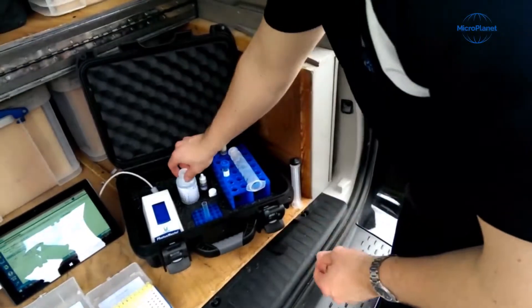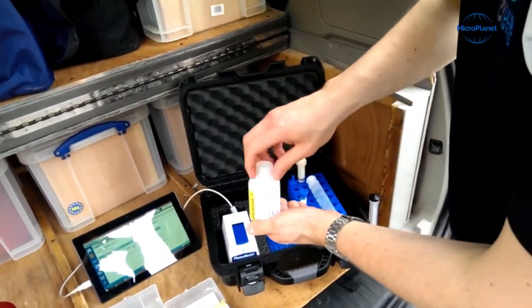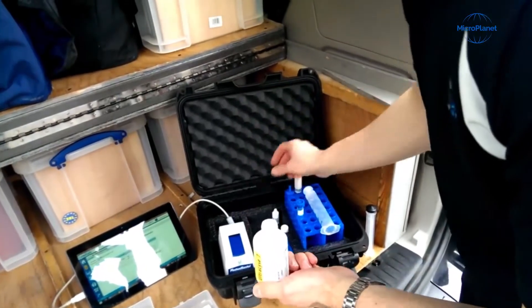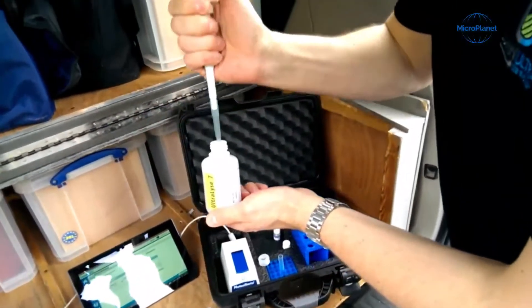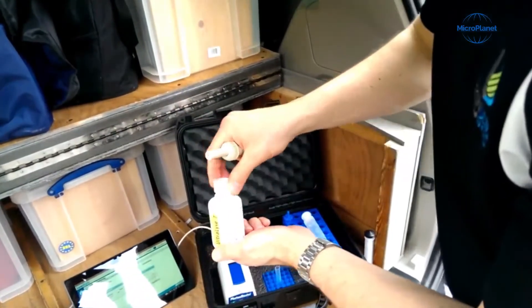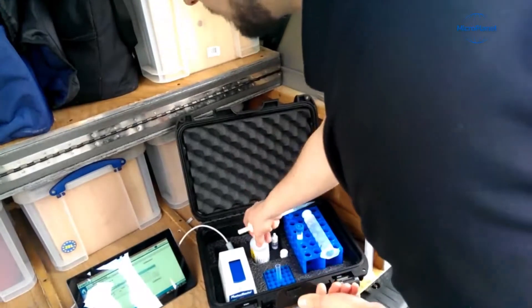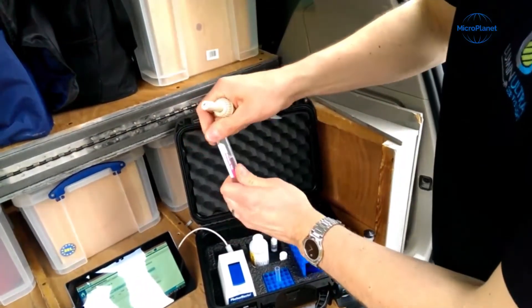We will then release the ATP from the cells we captured using our Ultralyce 7 Lysing agent. One milliliter of Ultralyce 7 is added to the syringe, and as it passes through the filter, it will be captured in our Ultralute buffer.